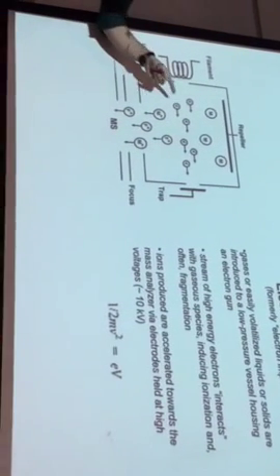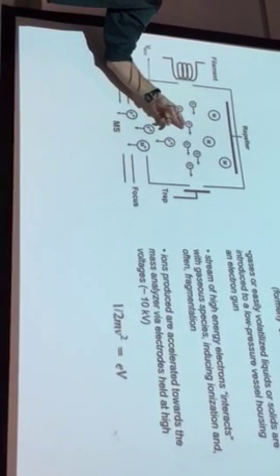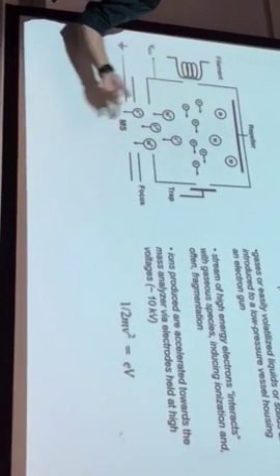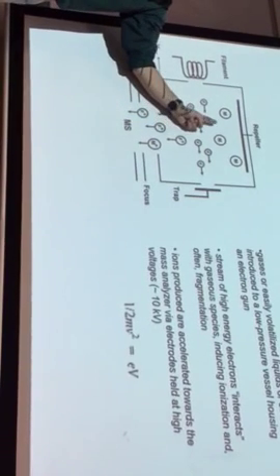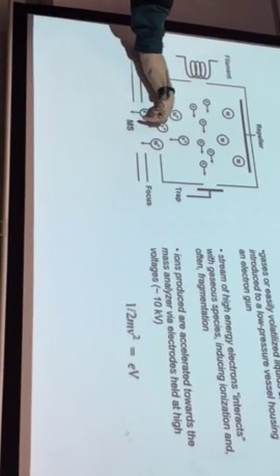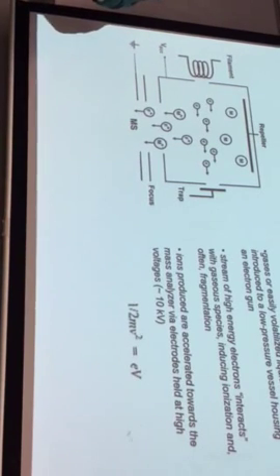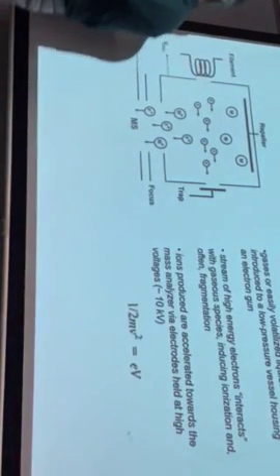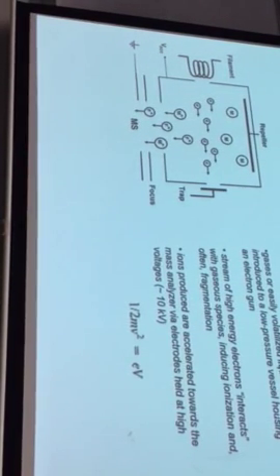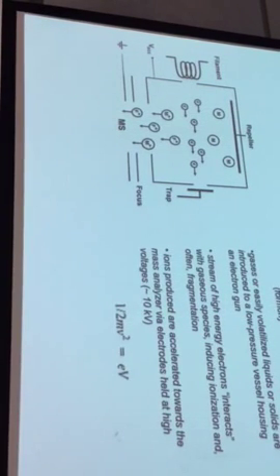Well, they might be a little bit different because they're in here diffusing around, correct? It could be at the moment of ionization, when they acquire the charge that makes them subject to that electrostatic ejection. Imagine some molecules might be diffusing in the opposite direction, some in the forward or downward or outward direction. So there'll be a slight spread of kinetic energies. But 1/2 mv squared, that's just the classical physics definition of kinetic energy, correct? Great. So what determines the kinetic energy? The accelerating voltage applied.